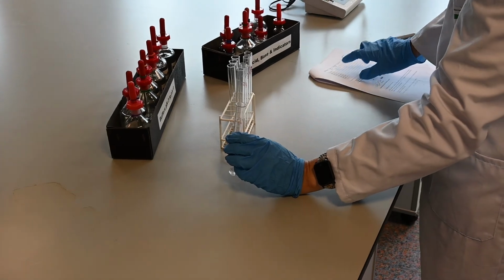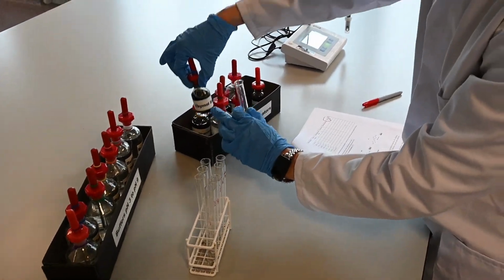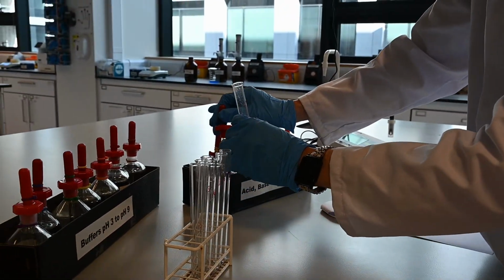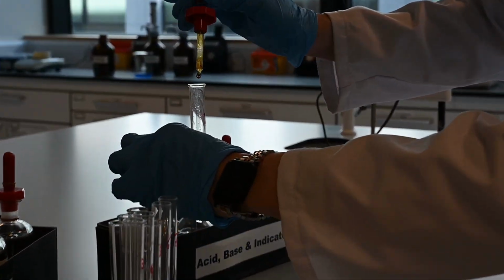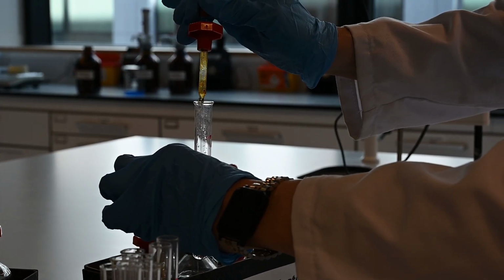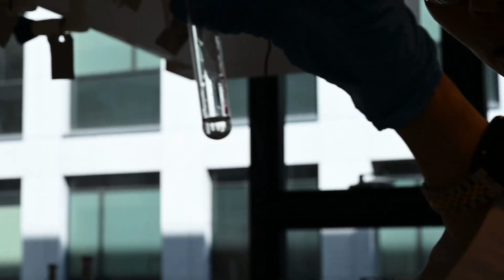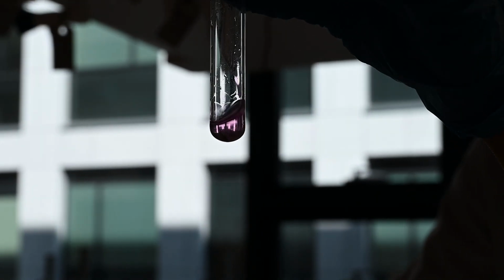And then you want to add thymol blue here. Make sure it's the right chemical. In this case, just a couple of drops, in fact not more than 2 drops. Observe. Oops, when it's not added inside here, it's on the walls of the glass. Ah, you see that? There's 1 drop. Just 1 more in case. Not too much.